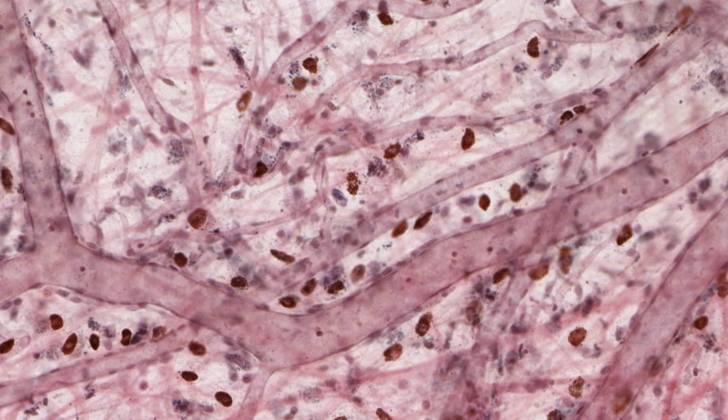One can play a trick with experimental animals to identify macrophages easily in any part of the body. The trick is to inject a colloid pigment, such as trypan blue, carmine, or India ink, into the peritoneum of a living animal. One week after the injection, the animal is sacrificed. Phagocytes all over the body will have phagocytized the injected coloured particles.